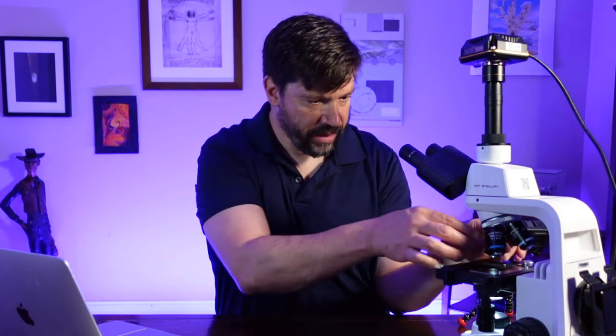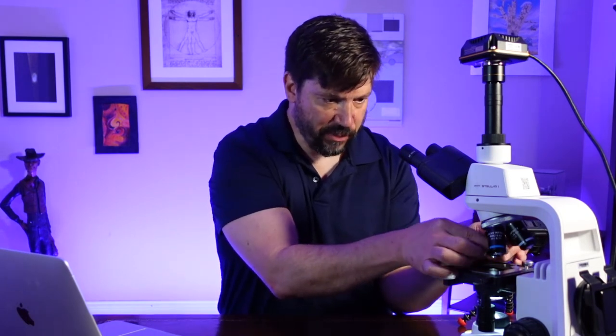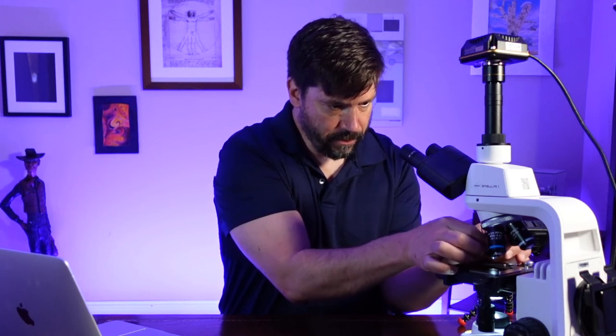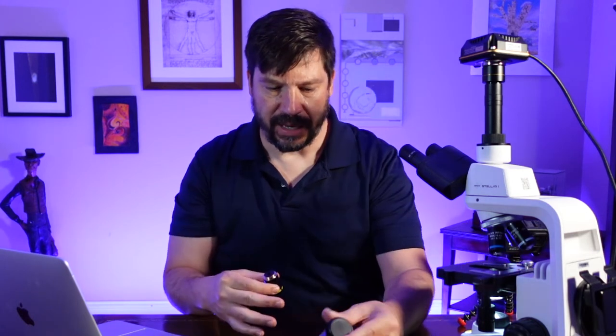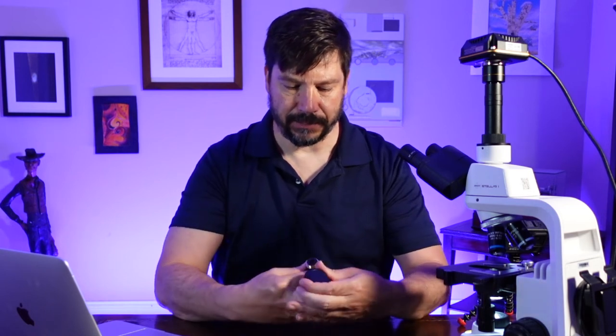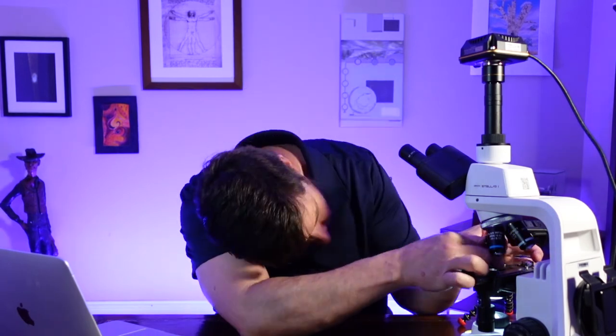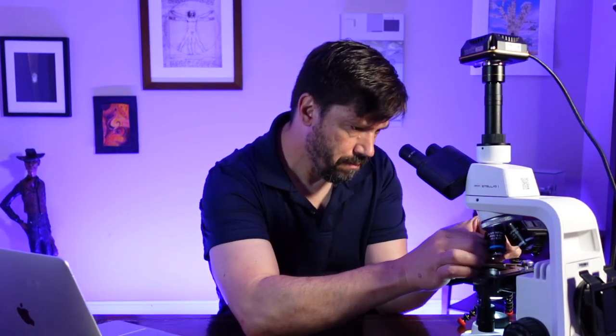If you've not replaced lenses in the past, this is a very easy process. It just takes unscrewing the lens and then screwing the proper one on. So I'm just unscrewing the 10x lens. There we are. And now I'm going to replace it with the 20x lens. All right, so the 20x lens is in place. Now let's replace the 100x lens with the 60x lens.